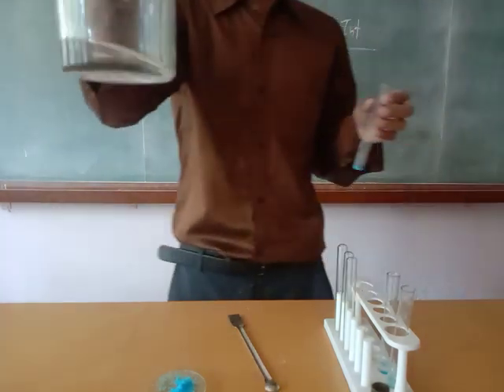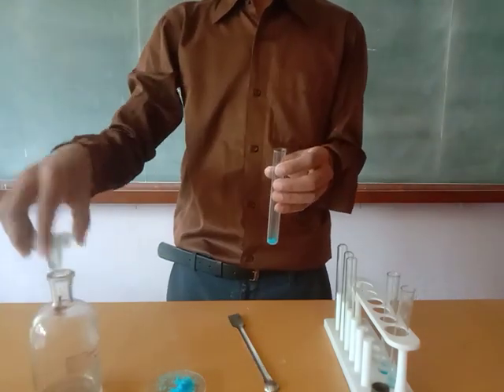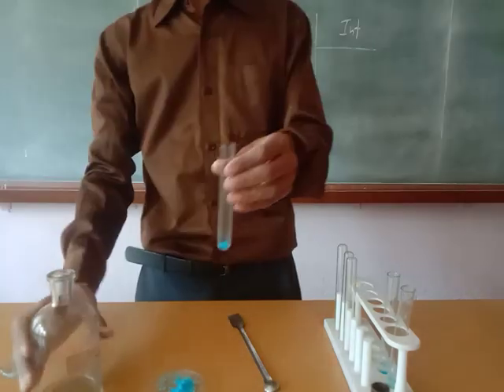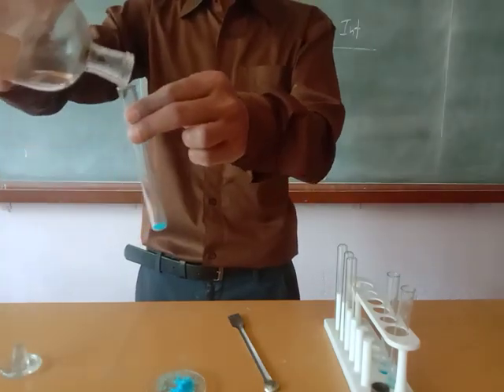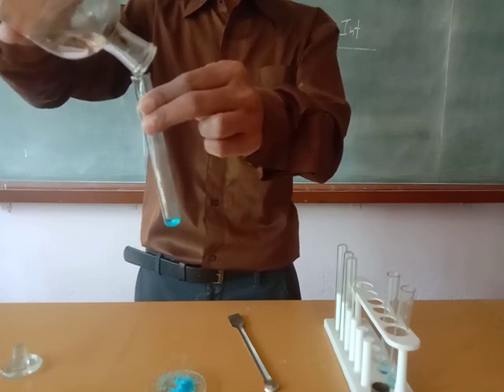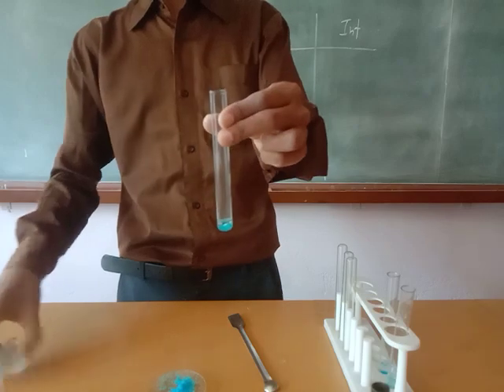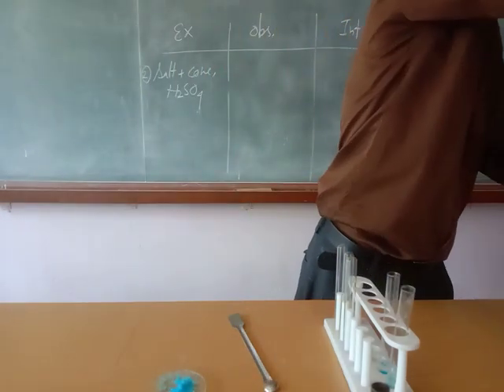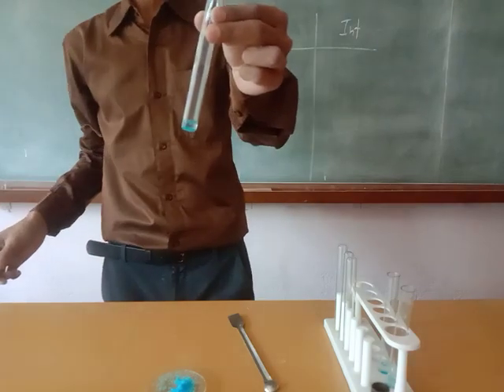This is concentrated sulfuric acid. Now I have added concentrated sulfuric acid. This is sufficient. At room temperature, there is no observation.